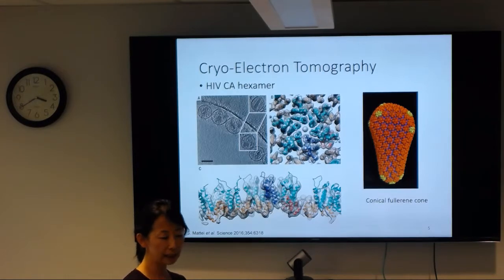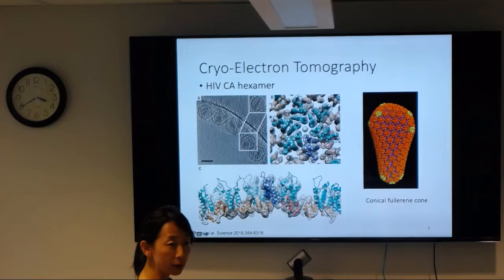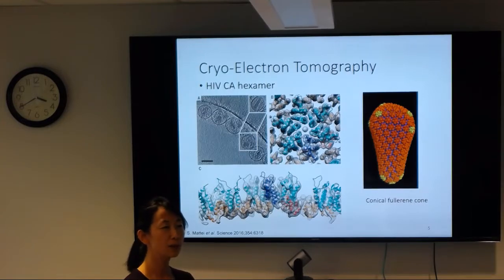They made tomograms of the whole virion, and then looked at the top view and side view to see the capsid structures. By very finely tuning all the parameters and controlling very detailed parameters in their project, they were able to reach 6 to 7 angstrom resolution by subtomogram averaging. I see that as really impressive.